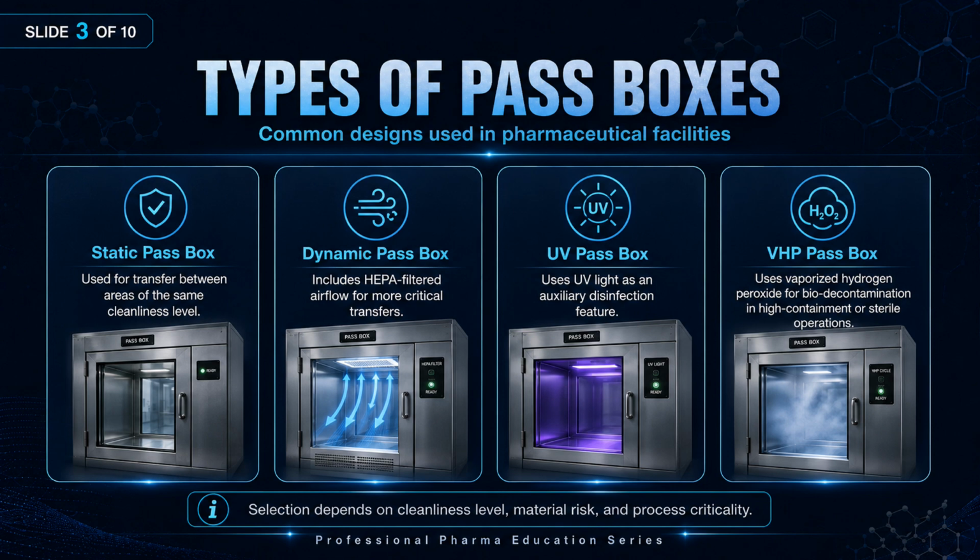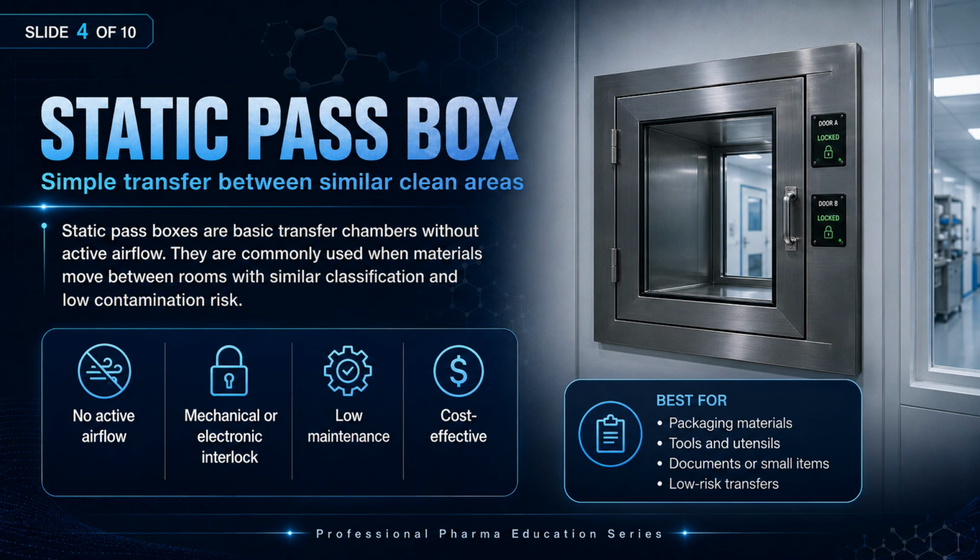Static pass box. A static pass box operates without an active HEPA-filtered airflow system. It is generally suitable for low-risk transfers between areas with similar cleanliness classifications and compatible pressure conditions.